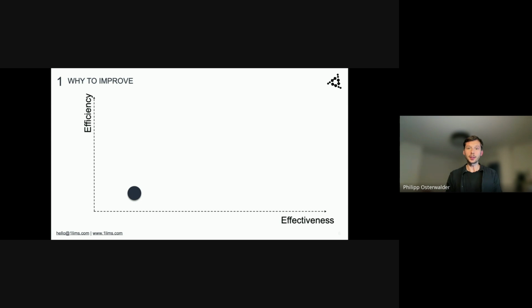And there is also a myth in the head of a lot of transformation and digitalization people. They think that there is only one tool we can implement and then we get rid of all our problems. And that's not really the truth and also not the case. So first things first is what kind of processes and workflows we want to digitalize.